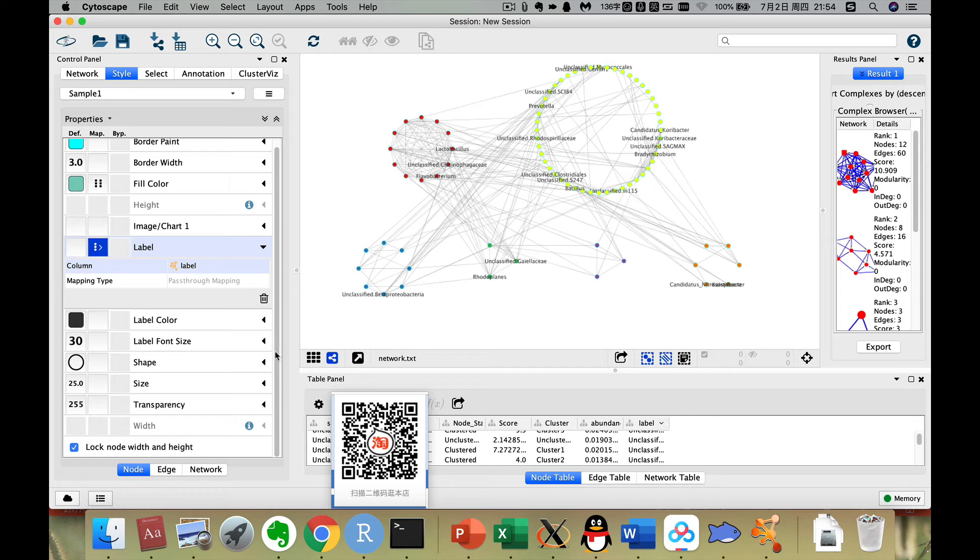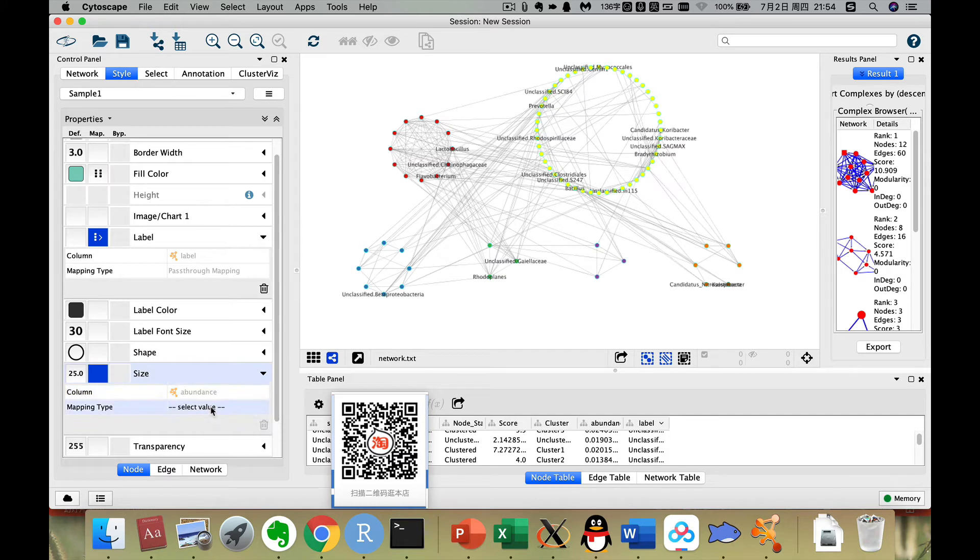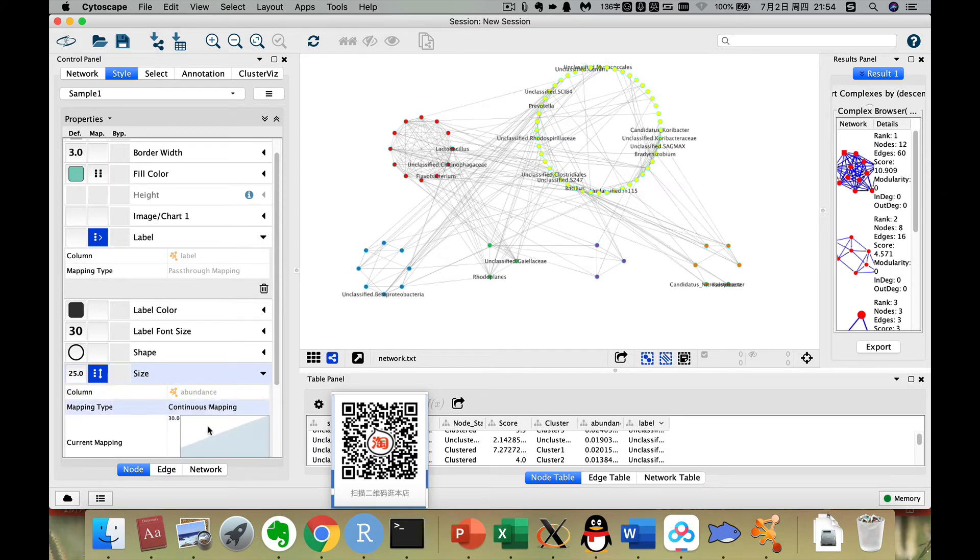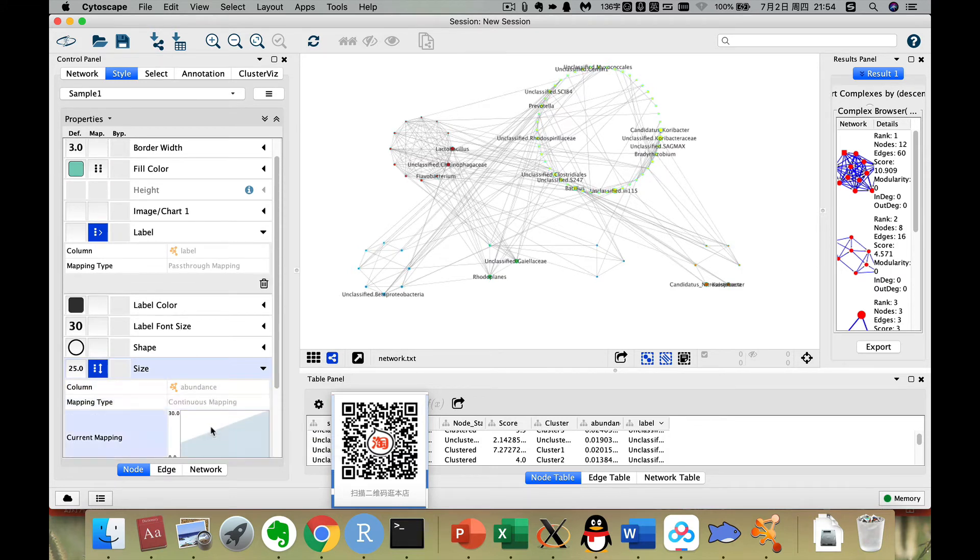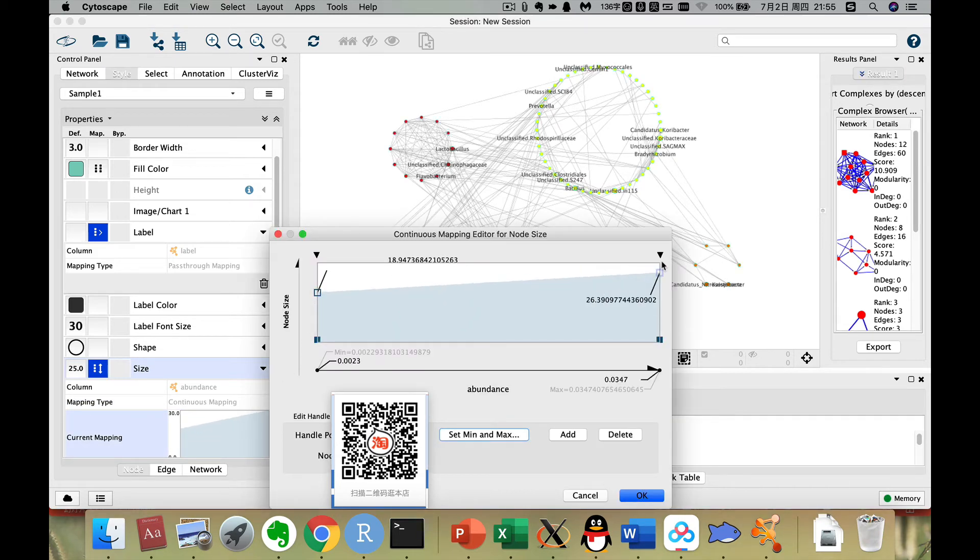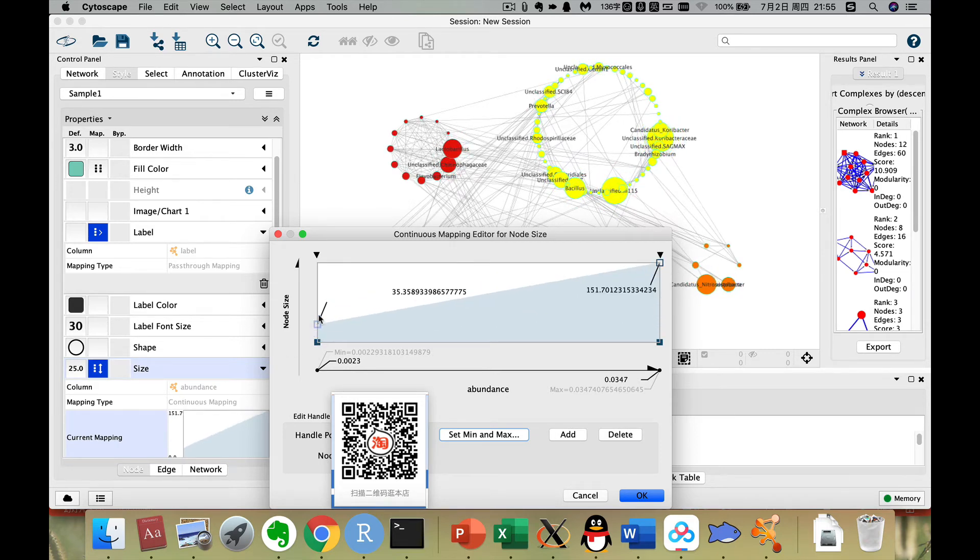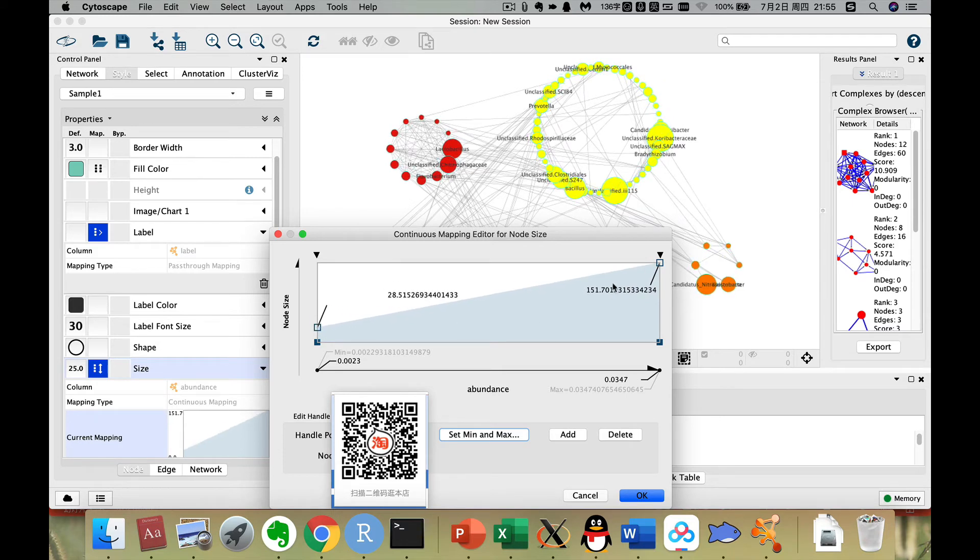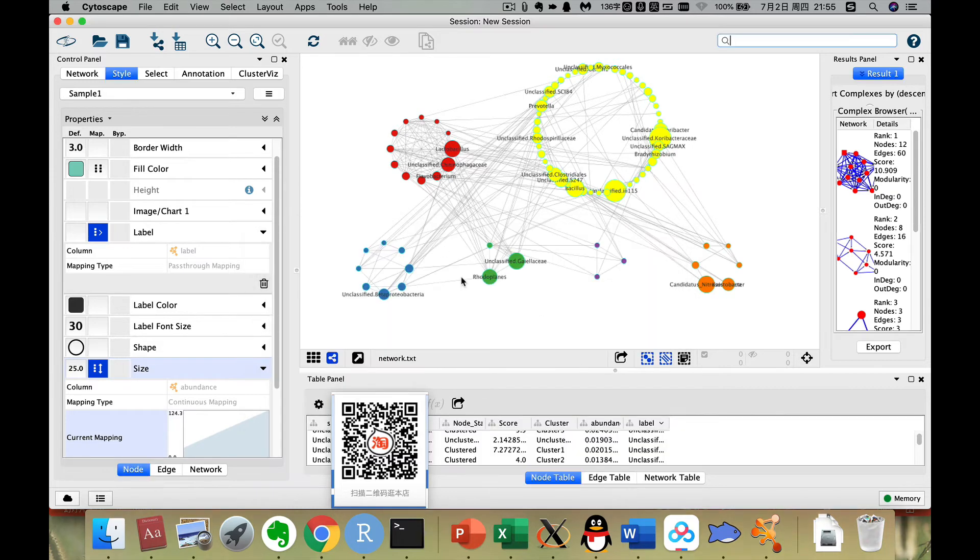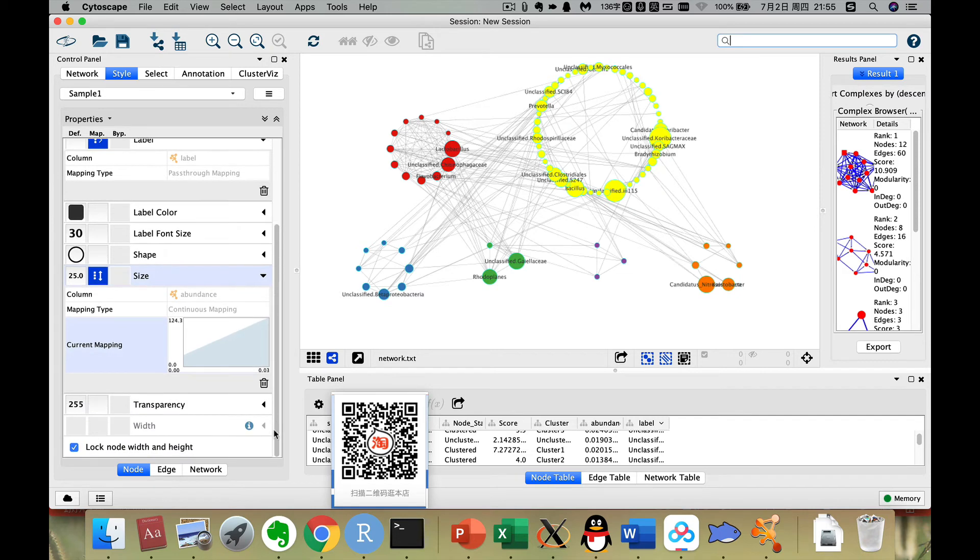Now we use the label size. It is too small, then maybe we can choose 30, then it's better. Then also we can change the shape of it. No, we also just keep it as a round one. The size of it, you click abundance, then we select, this is a continuous mapping. Then we double click it. Then you can increase the size of the smallest one, increase the size of the largest one. This is a scaling. Right, now it's okay. Now the attribute has been changed, has been set.